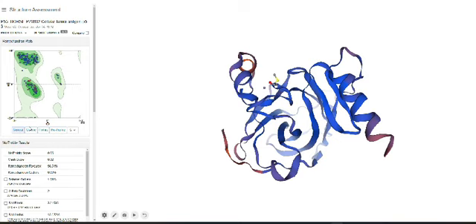Here in the bottom part, we have some options that allow you to analyze specific types of residues. This General option shows all residues, and this is Glycine. Glycine residues have greater flexibility due to the lack of a side chain, and may appear in less favorable regions also.